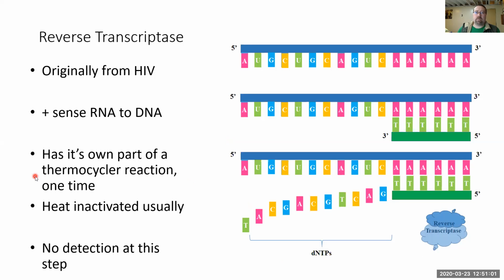Does anybody have any questions so far? I've used a lot of terminology. Some of you have had polymerase chain reaction before, and I'm going to go into it, but I've used thermocycler, I've used primers. Are there any questions there before I go on? Okay, I'm having shaking of heads. Nobody's fallen into a coma so far. Day 1 is a success.